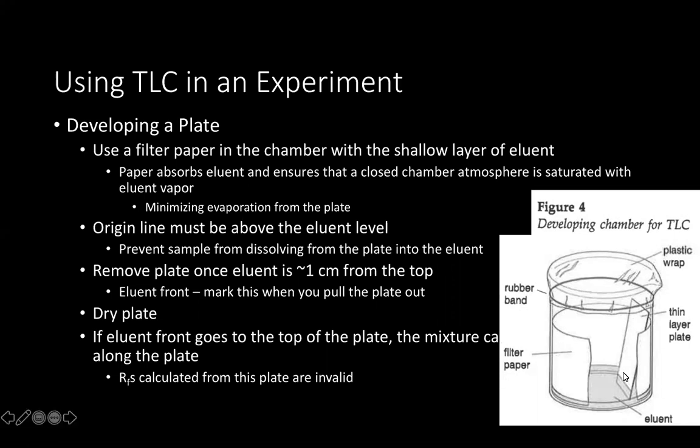Also, I would always make sure that I can see my TLC plate. Notice how they have it leaning back. That's so that they can watch that eluent front move up and they don't miss pulling the TLC plate out when the eluent has moved up far enough along that stationary phase.